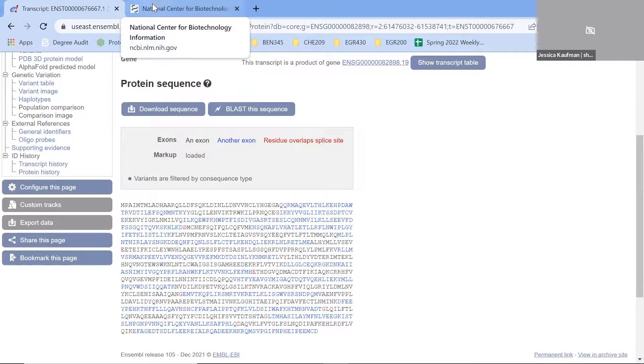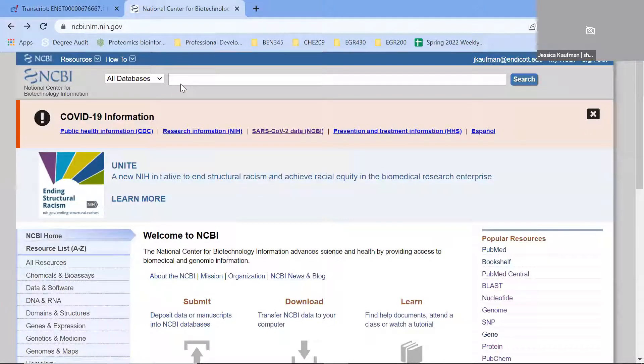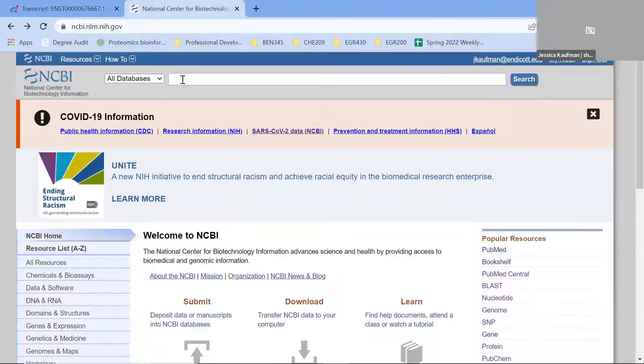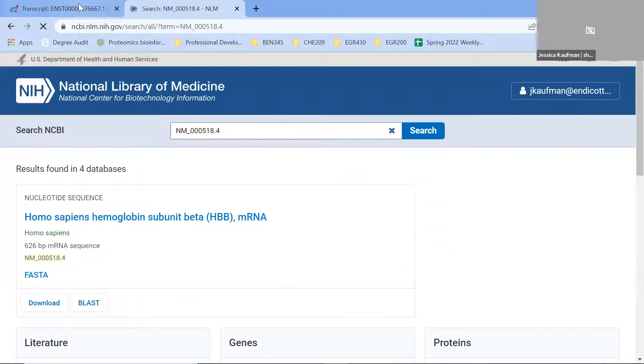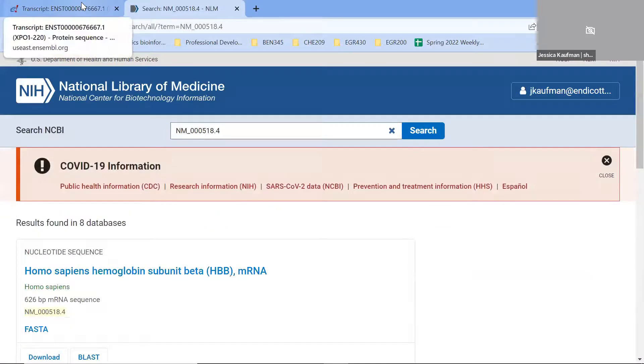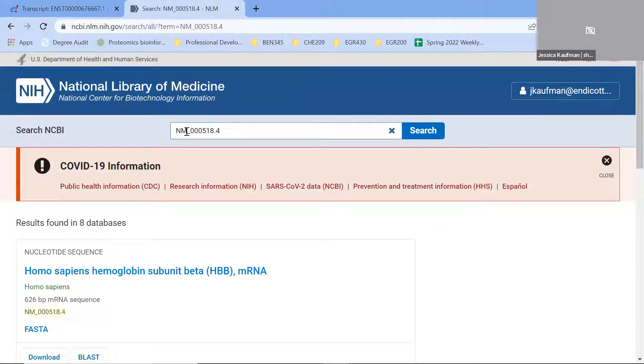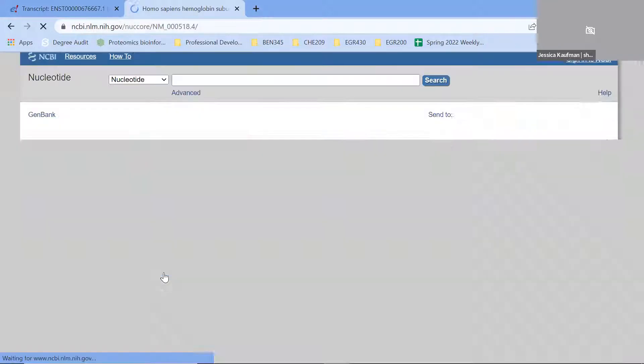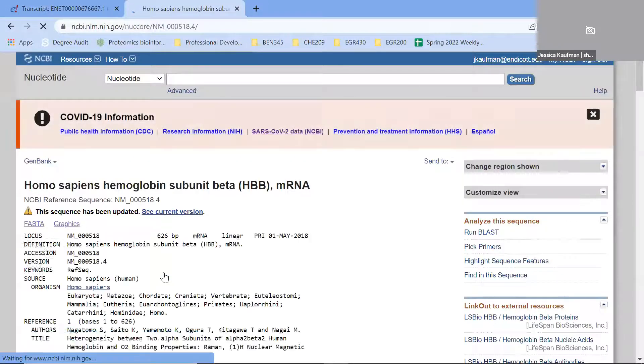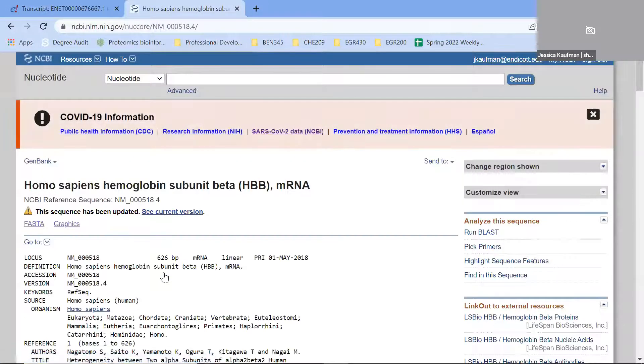The last thing I'm going to do is a similar process of finding a unique sequence on the U.S. system. I'm going to paste the NM number. This is for our messenger RNA. Just like we explored messenger RNAs or ENST numbers on Ensembl, they're NM numbers on NCBI. We see that this is the messenger RNA that encodes the beta subunit of hemoglobin.